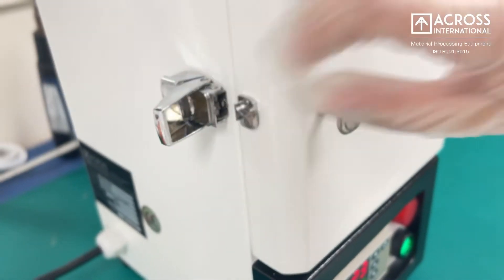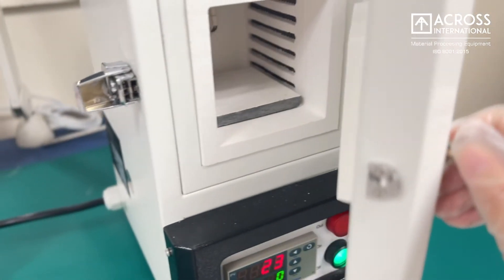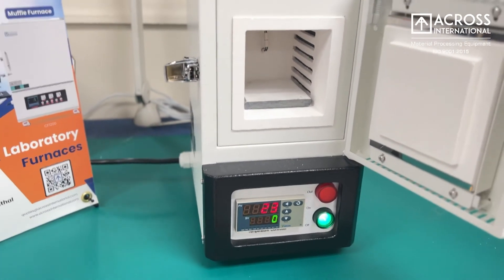All our furnaces are built with Mitsubishi high-grade aluminum ceramic insulation for durability and minimal heat loss, for optimal heat treatment results.